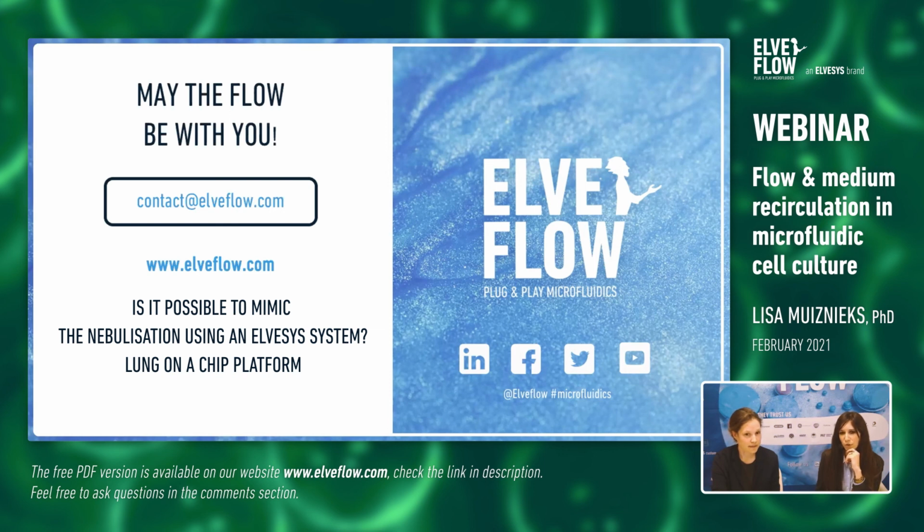So that is possible, knowing that the OB1 needs an external pressure source. So usually you use air or maybe nitrogen, CO2, but you can make your own gas mixture that you want to apply. This is the one that will pressurize the fluid in the reservoir and that will reach also the side of your chip where you want to put this gas in contact with your cells, for instance.